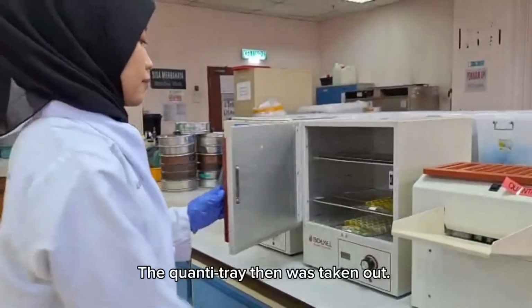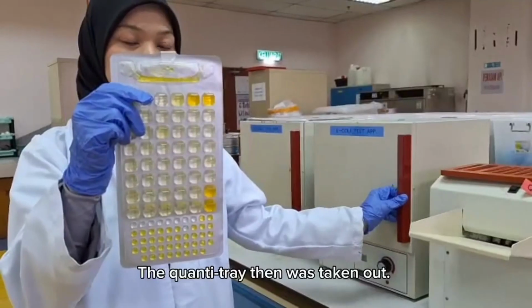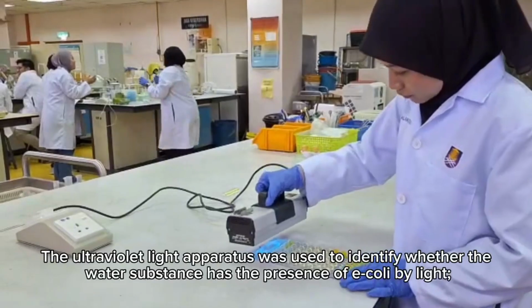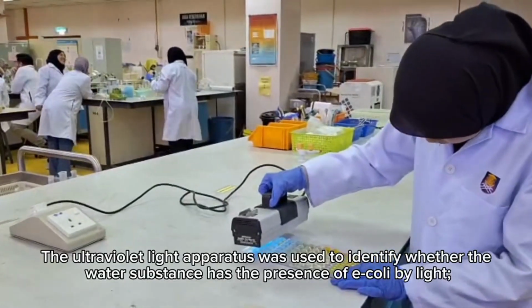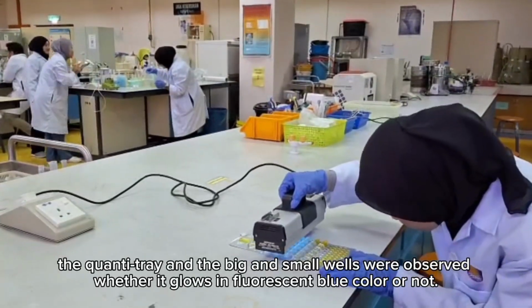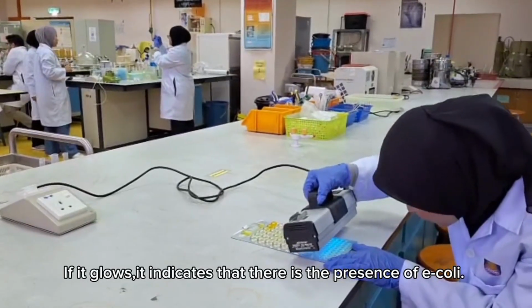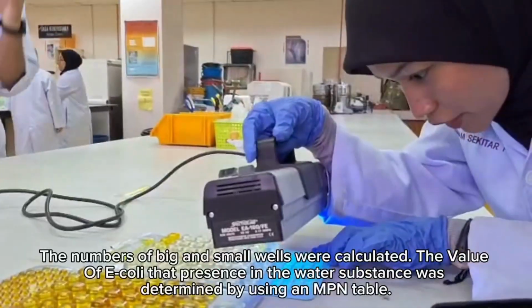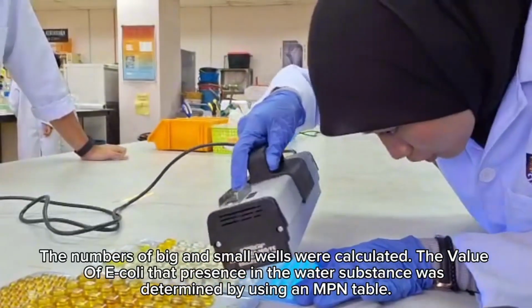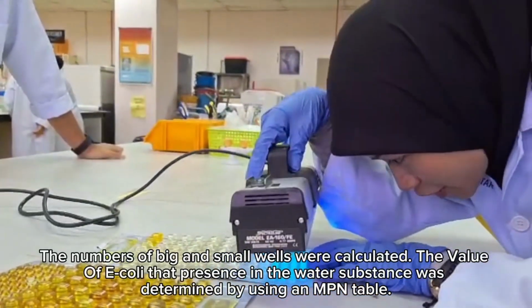The Quanti-Tray was then taken out. The ultraviolet light apparatus was used to identify whether the water substance has the presence of E. coli by light. The Quanti-Tray and the big and small wells were observed, whether they glow in fluorescent blue color or not. If it glows, it indicates the presence of E. coli. The numbers of big and small wells were calculated. The value of E. coli present in the water substance was determined by using an MPN table.